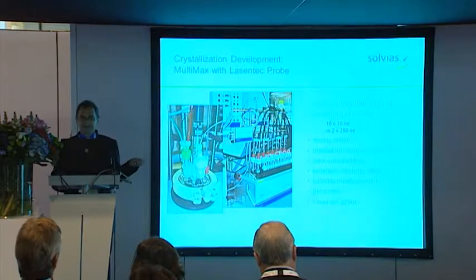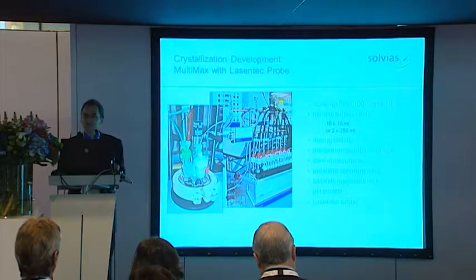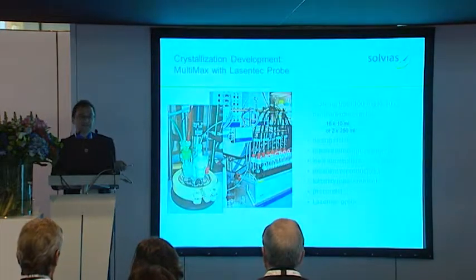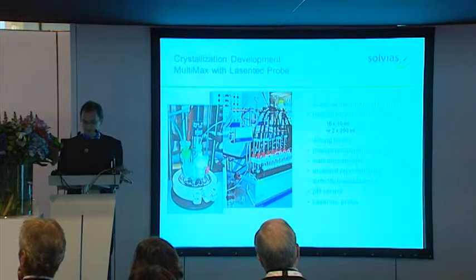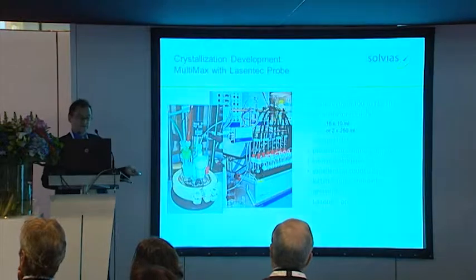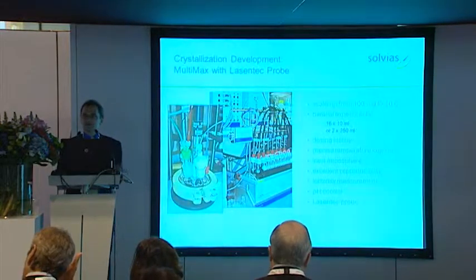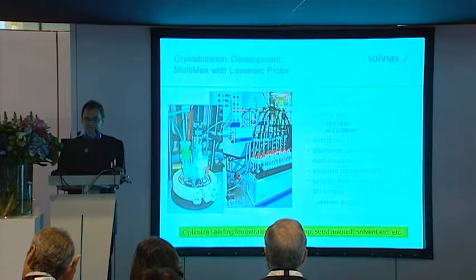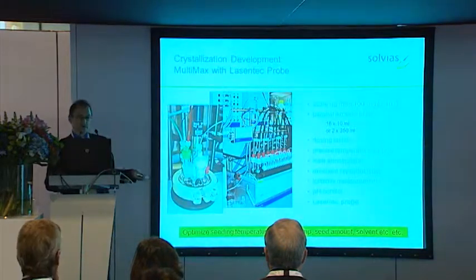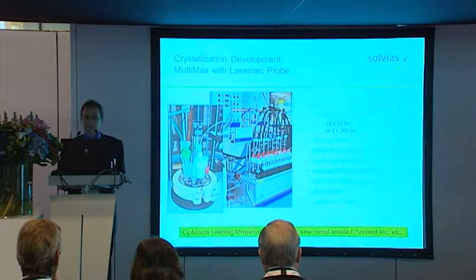And of course, with that equipment, we have optimal control over the crystallization process. We have small test tubes for metastable zone width equipped with turbidity probes, and then larger vessels with proper stirrers which simulate the crystallization process very well, with these parameters I mentioned before to optimize.